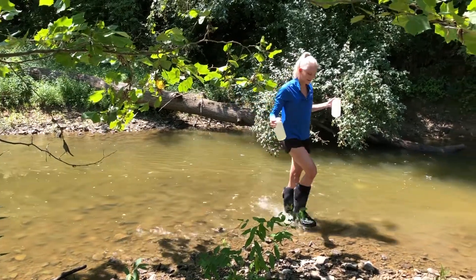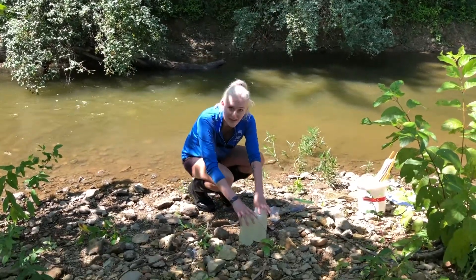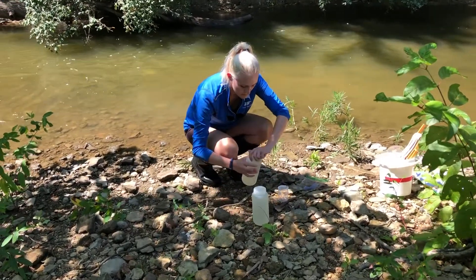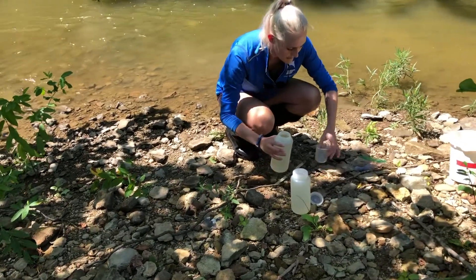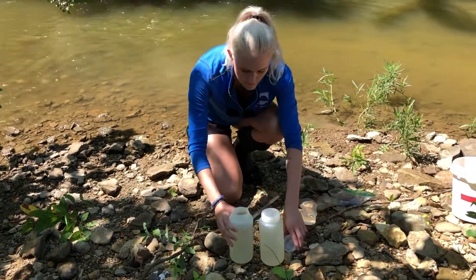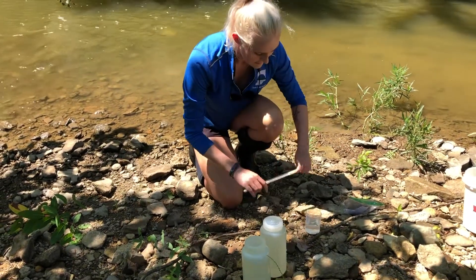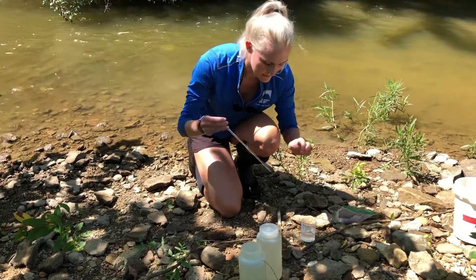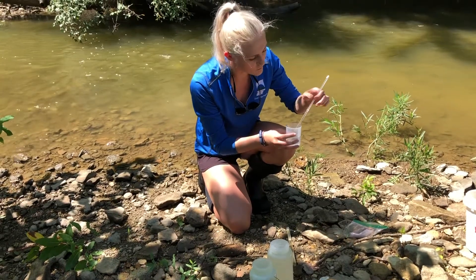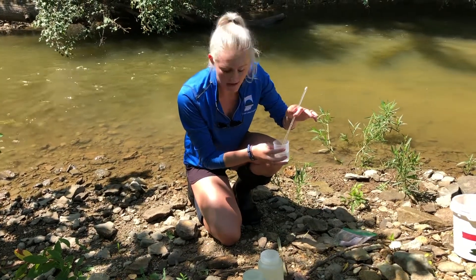That's all you have to do physically in the stream — you can go ahead and walk on out. Now I have the other supplies I've brought down here: my beaker, thermometer, and test strips. I'm going to take some of the water I just collected and pour it into the beaker. Cap back on — we don't want to lose any sample, as we do use this later in the lab. Now I'm going to take my thermometer and just stick it in the beaker. Temperature of water doesn't change too much, so just watch it. It works just like any other thermometer, and once the temperature stabilizes, you can go ahead and record that.